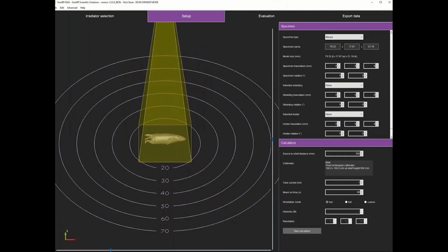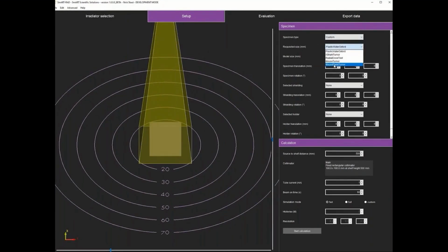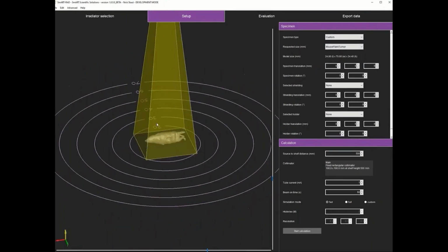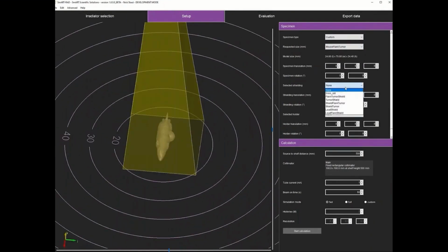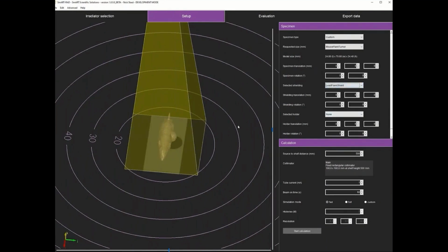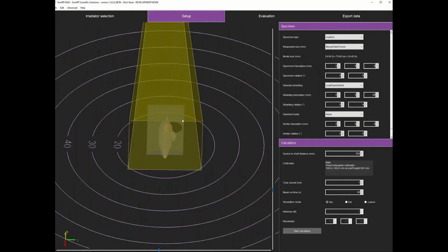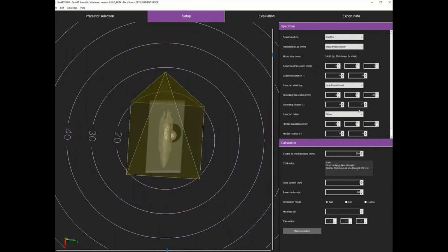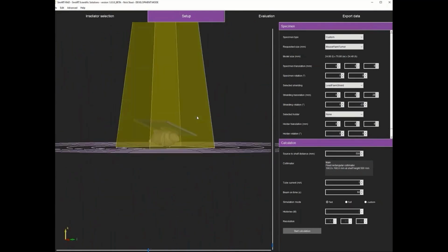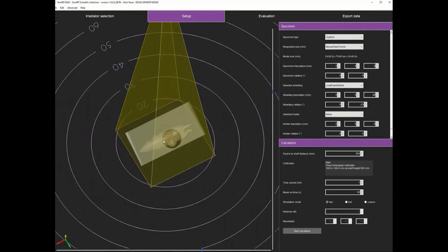So the next setup, we show a custom geometry, which we created earlier. I did increase the size of the tumor so it's visible here. And we also pick a shielding. Here the shield is a very large circular cutout. And just for demonstration purposes, we also incline the shield a bit to show that you can pretty much make very strange shapes if you would like.